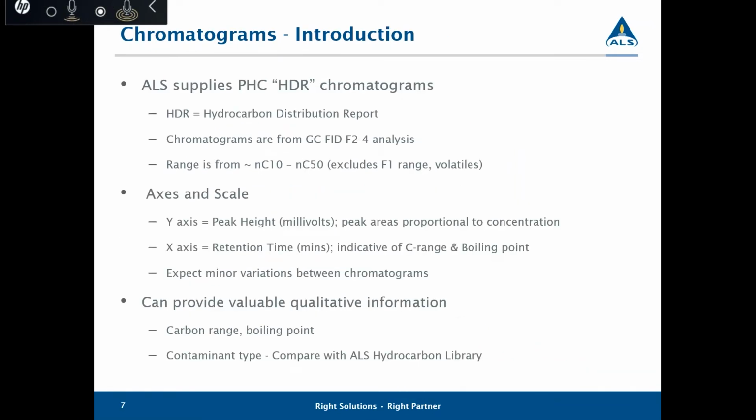In addition to the F2, F3, and F4 results, as ALS supplies the results to the client, we also supply the associated picture of the sample, which we call the hydrocarbon distribution report, or just chromatogram for short.